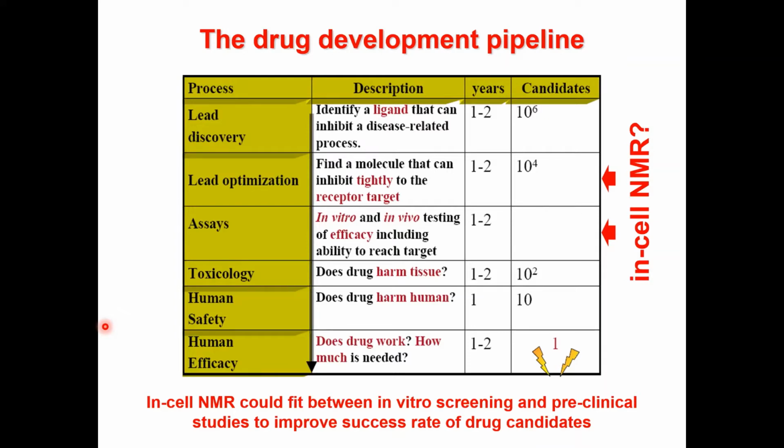The rationale was that in-cell NMR, being a structural technique able to investigate binding events in cells, could help the drug development pipeline, which is an intrinsically very inefficient and expensive process, between the steps of lead optimization and preclinical assays, in which you have found promising candidates in vitro, but then you need to test their efficacy in animal tissues before going to humans.